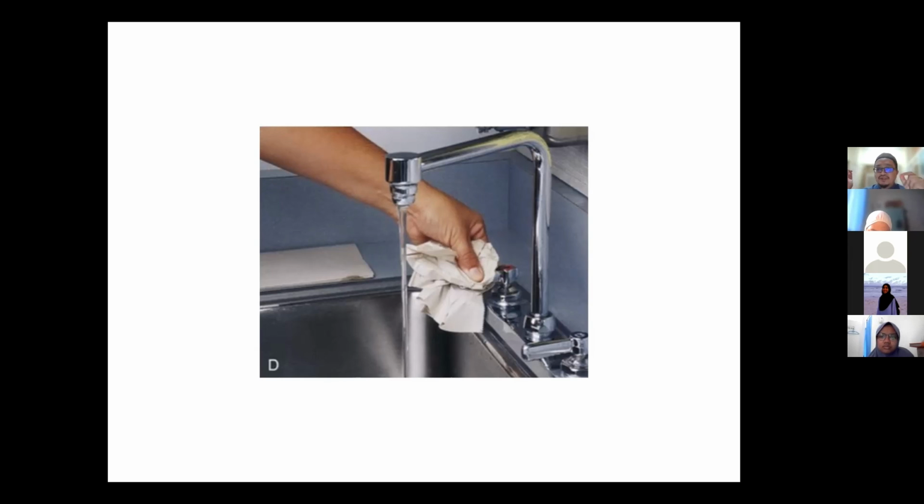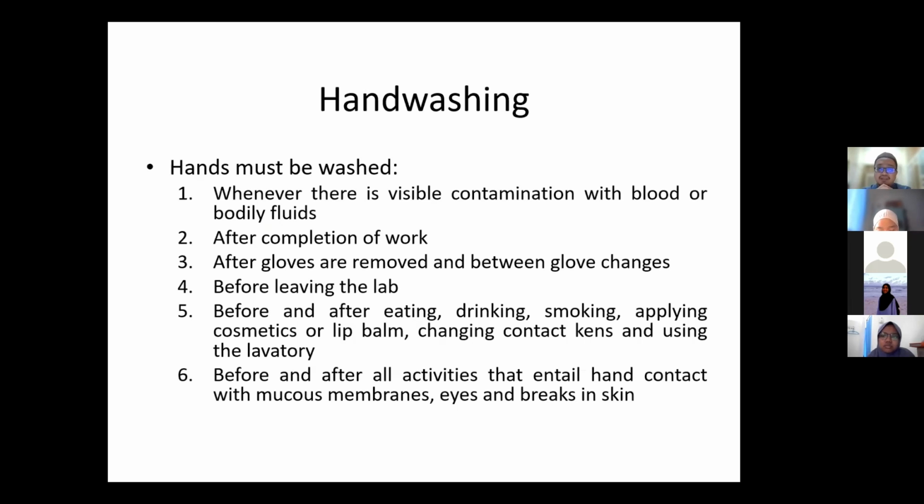But this is actually another thing that you can do. You close the tap using the tissue. Okay. Hand washing. Hands must be washed whenever there is visible contamination with blood or bodily fluids after completion of work. Whether your hands is dry, tak ada touch apa-apa semua, tapi after you complete the work, you just wash.